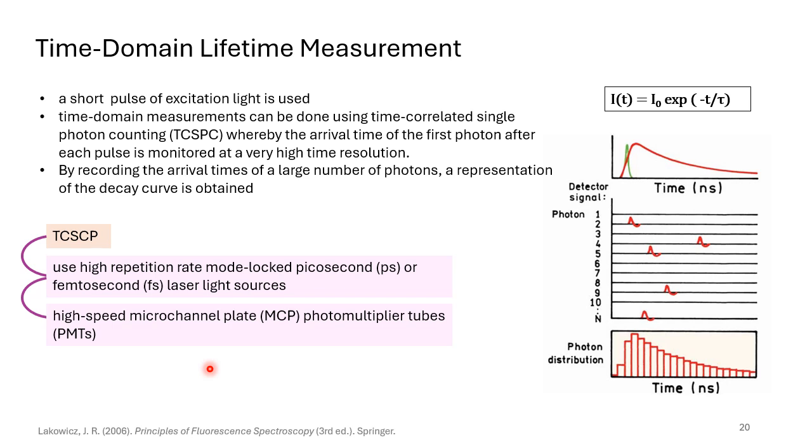It uses high repetition rate mode locked light sources, like picosecond or femtosecond lasers, and high speed. Also the detector should be a very high speed and sensitive detector for this measurement.